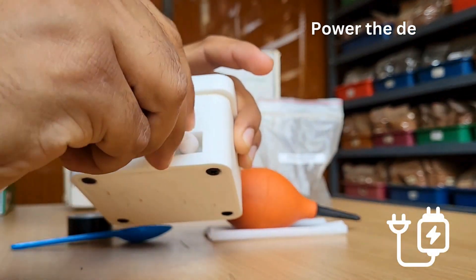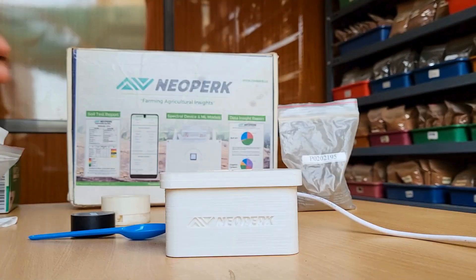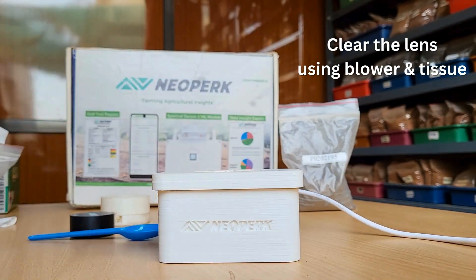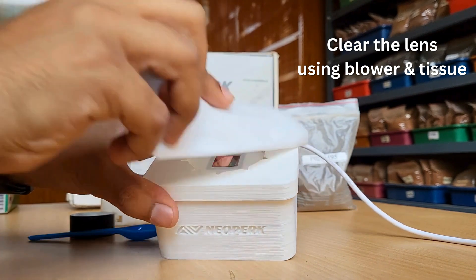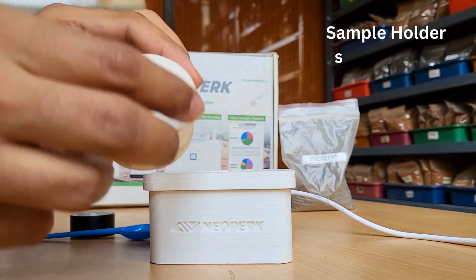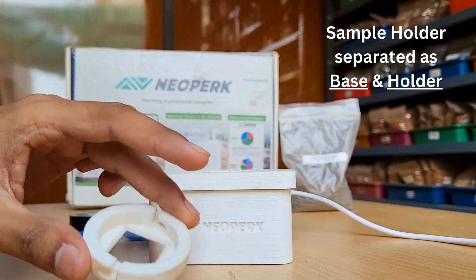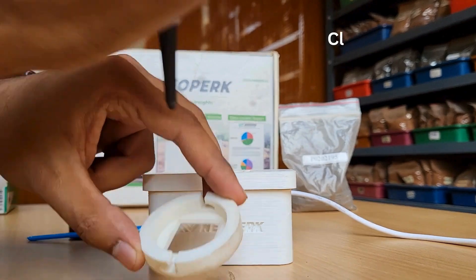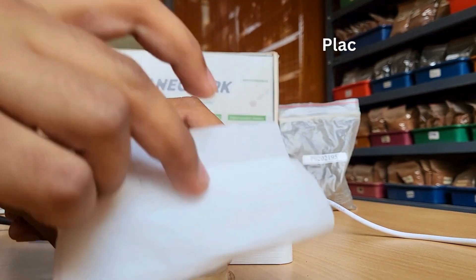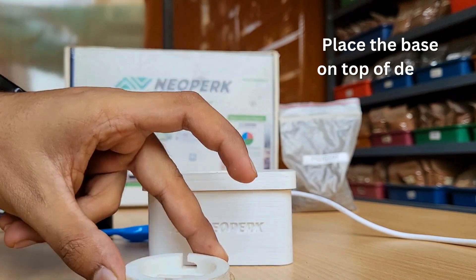Now let's connect the device and clear the lens using a blower and clean tissue. The sample holder can be separated into base and holder, and it is also important to clean the base before starting an analysis. The clean base is placed on top of the device.